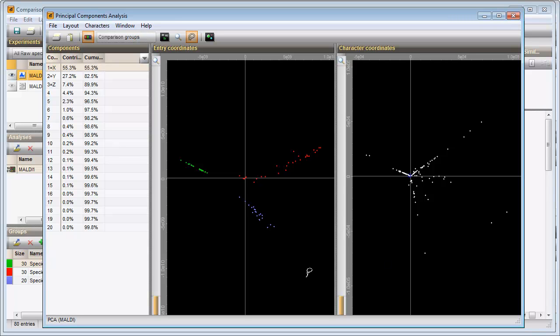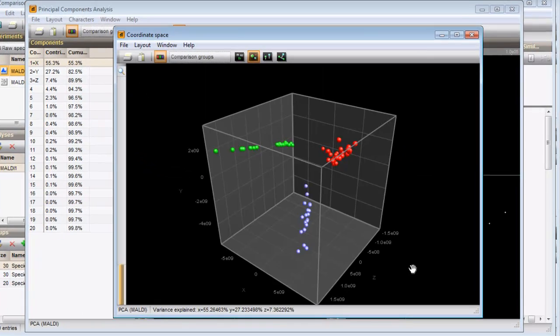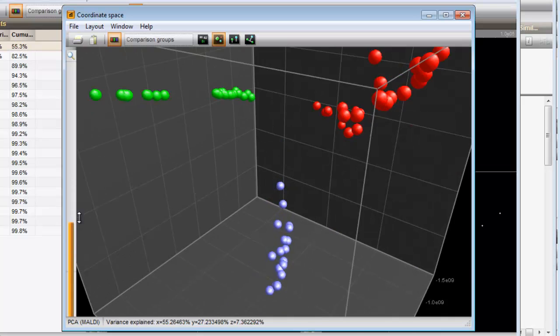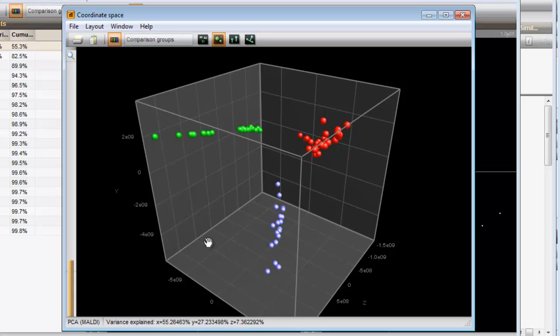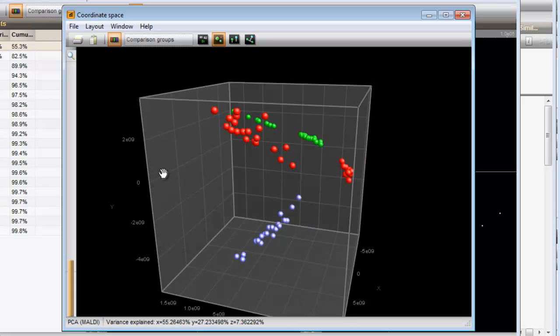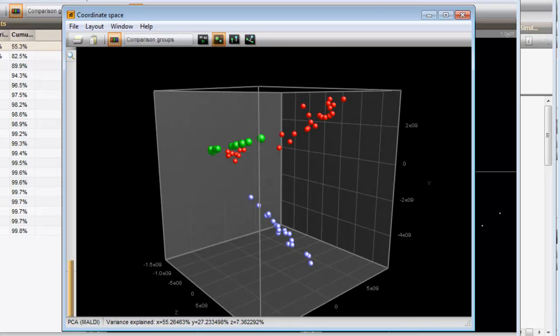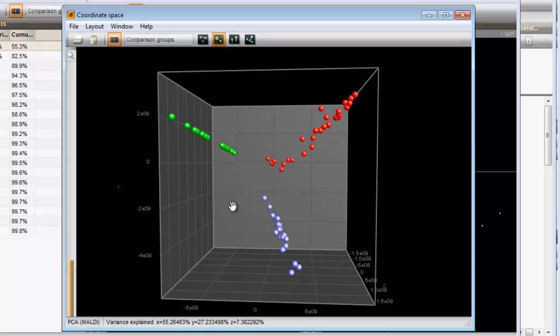To obtain a three-dimensional view of the PCA analysis, you can press this button. You can zoom in or out of the plot with the zoom sliders or with the Page Up or Page Down buttons. The image can be rotated by clicking and dragging. In the 3D view the same can be seen — the three species form distinct groups. This ends this video.